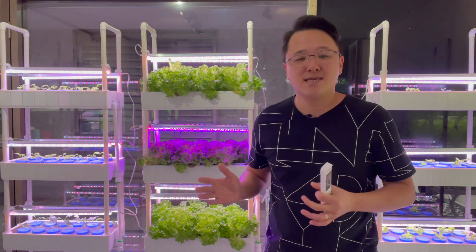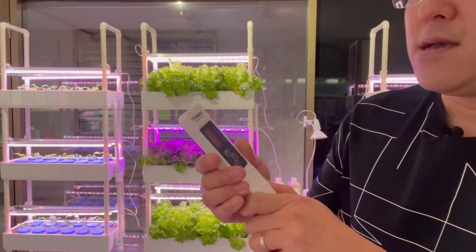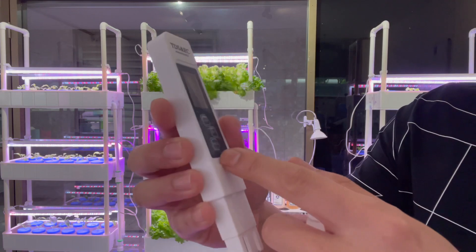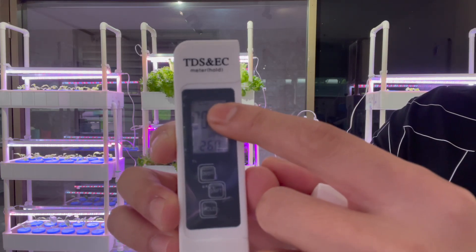Let's have a look at how to use this meter. So let's open it up, and there are three buttons right there. The first will be the on and off. We're going to turn it on. When it's on, you will see the meter is reading on EC.